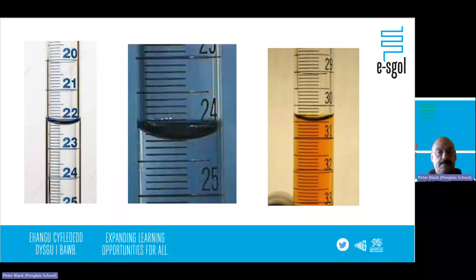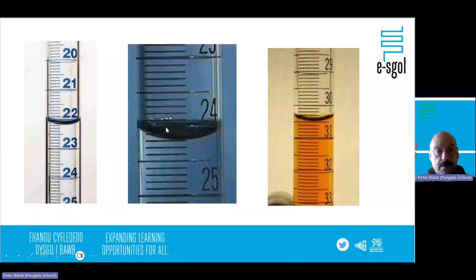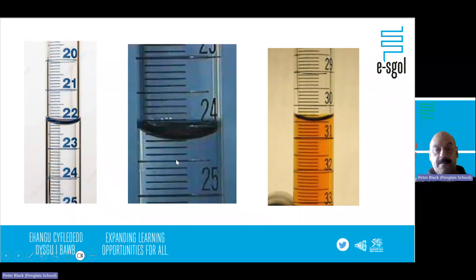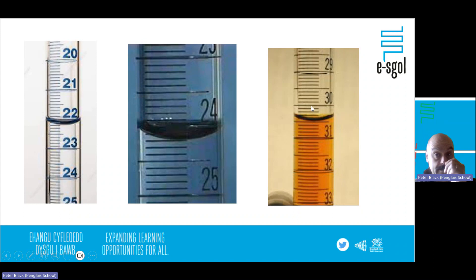A quick burette reading practice: the first reading is 22.20, the second I'm reading as 24.20, and the third is at 30.50. Remember to record to 0.00 or 0.05. Sometimes it's worth double-checking by counting divisions forwards and backwards to confirm your reading.